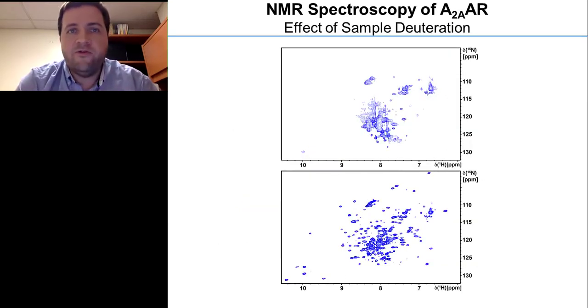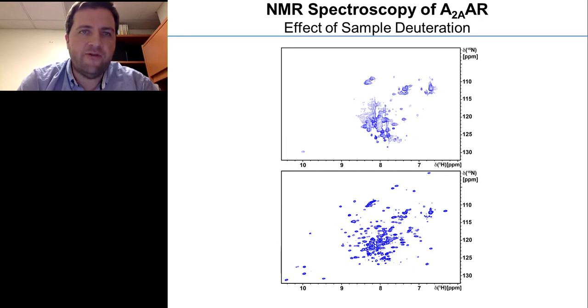So why did we use Pichia pastoris and go to such great effort to validate the expression system? The reason is simple. We can incorporate deuterium oxide into the expression media for yeast. Yeast tolerate high levels of D2O, and the D2O is necessary to obtain the high resolution spectra that you see. On this slide, we compare the effects of a uniformly nitrogen-15 labeled sample with and without deuteration.